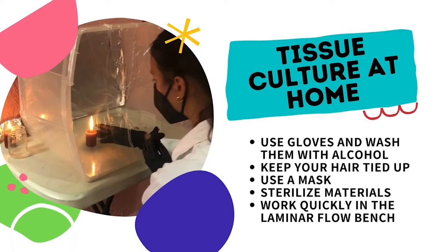General rules for tissue culture are to avoid contamination on the medium, maintain a good posture, use gloves and wash them with alcohol, keep your hair tied up, use a mask, sterilize materials, and work quickly in the laminar flow bench.